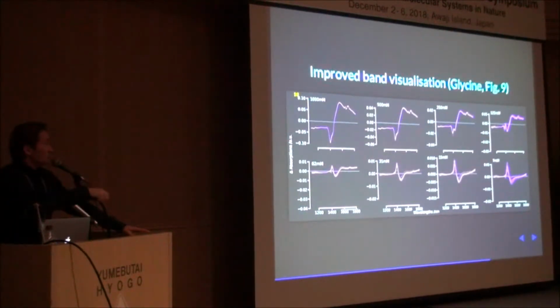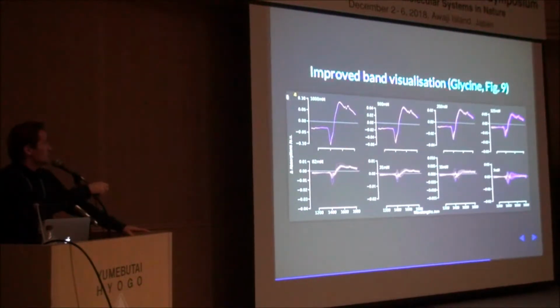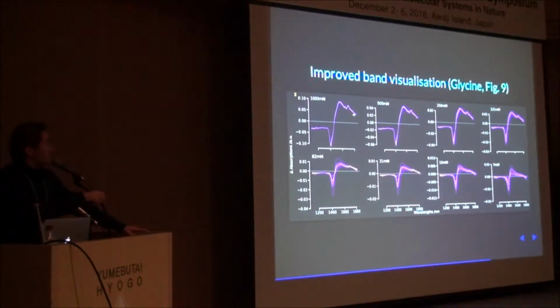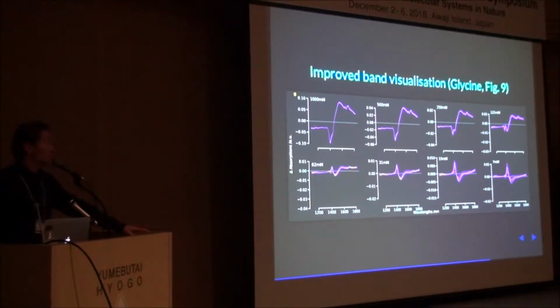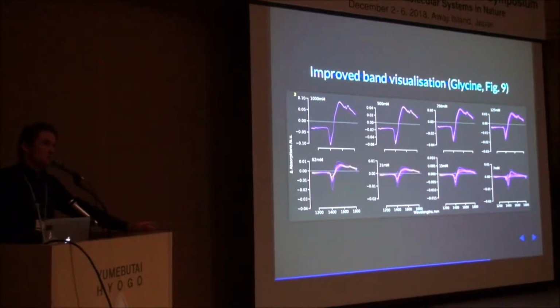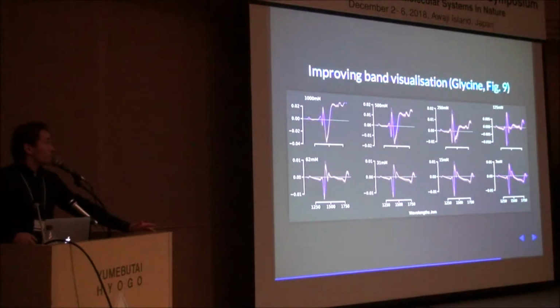So these same spectra here, you're watching them change as a consequence of the proximity to water, and you can see that they change a lot. By the way, these few bands here are CH bands. Everything else is mostly related to water. And what happens if you take that database and you subtract the closest spectrum? What is the outcome? So this is the outcome.